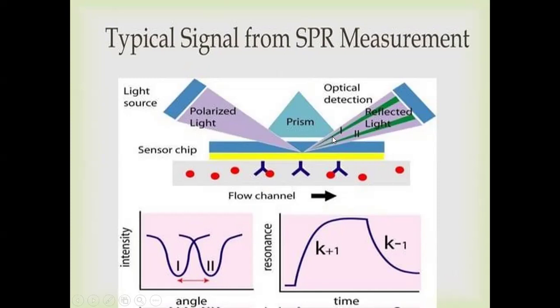So by measuring this angle of deviation, you can observe the concentration of the analyte that is attached to the antibody, or how positive the reaction is. You can see here two phase shifts of reaction, phase 1 shift and phase 2 shift, and you can see the resonance of the particles keeps increasing as the reaction is positive.